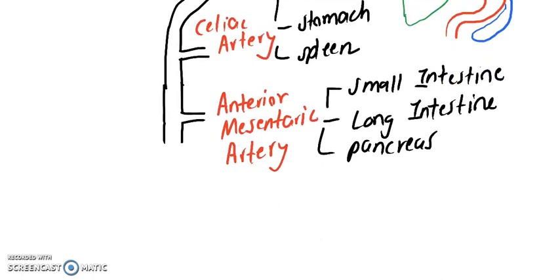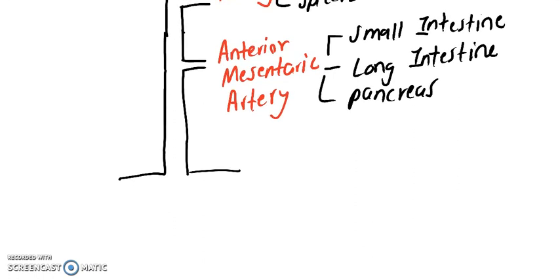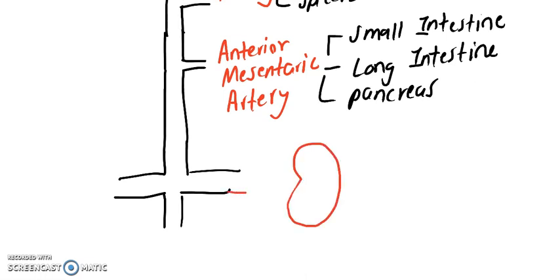Okay. So these are hard to see for the fetal pig. You won't be responsible for these two. But further down, we are going to have one on each side in this case. These are actually connected to these organs that filter your blood. And these are your kidneys.